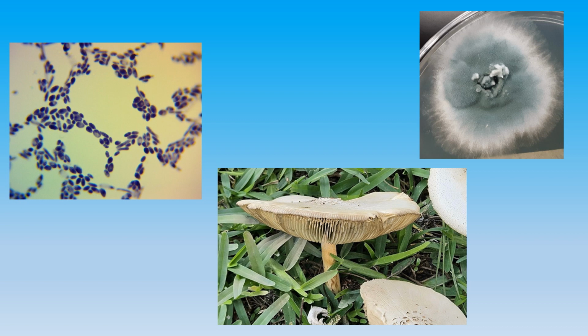There are several pictures on here. This slide up here is showing yeast cells. So they are single cell. You have lots of them in here. They look just like little circles or little ovals. Over here is fungi growing on a petri dish. And you can see it kind of has that classic fuzzy look on it. You definitely don't get individual colonies like you do for bacteria. This sample over here was actually taken from a piece of blue cheese that we applied onto the Sabouraud agar, and then it just allowed it to grow at room temperature.